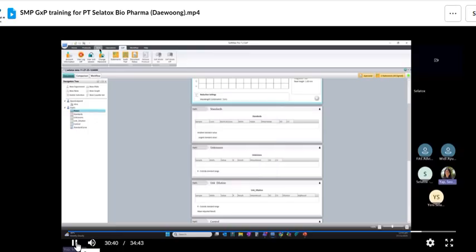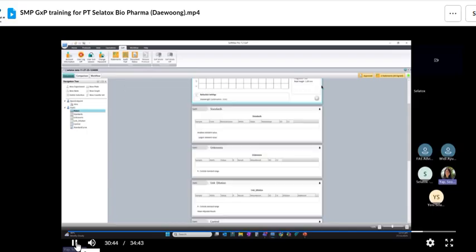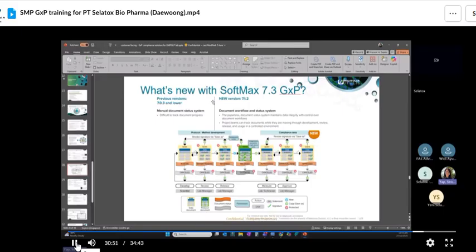Okay, so it's auto approved. If you go back to the folder, you see it's approved already. All right, that's it for the SoftMax Pro GxP training. I will pause here to see if you have any questions for me.